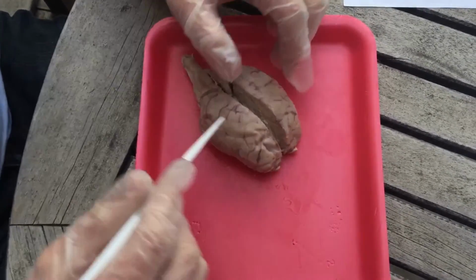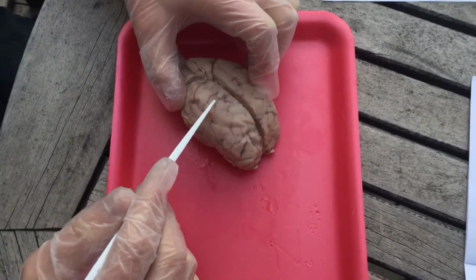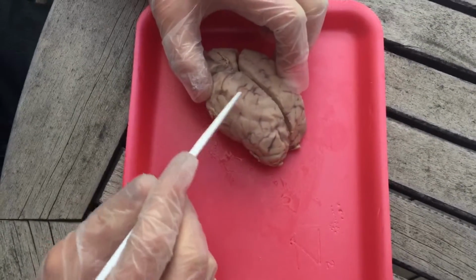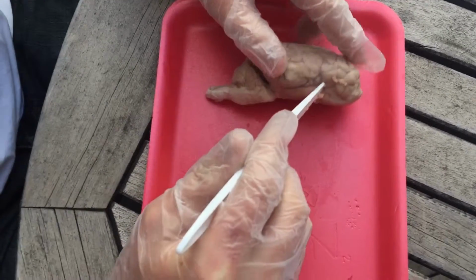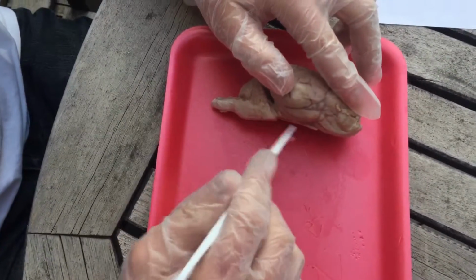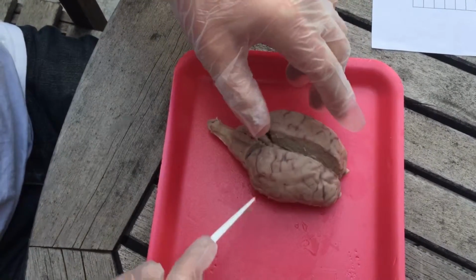And then the occipital lobe, which is this part of the cerebrum, is the back section and is responsible for vision. And then last, we have the temporal lobe, which is this bottom section, or the side of the cerebrum, and that is responsible for speech.